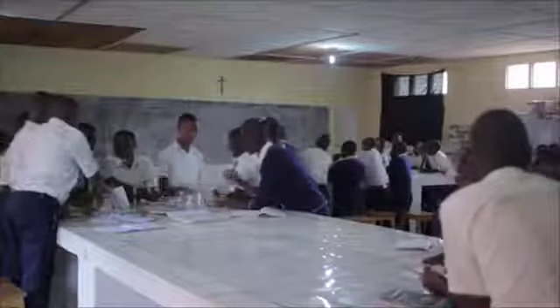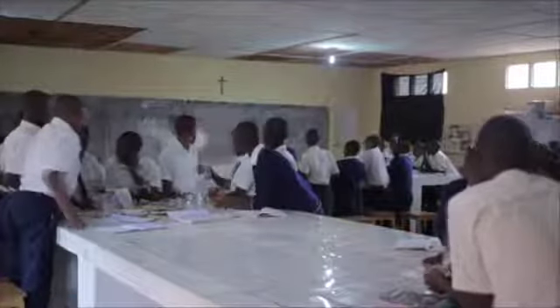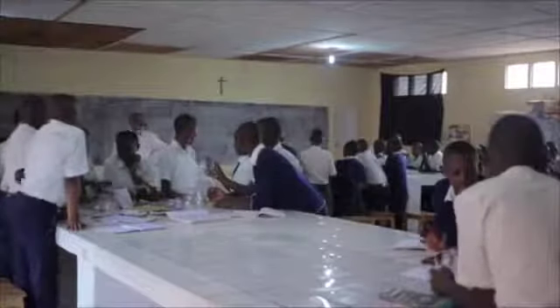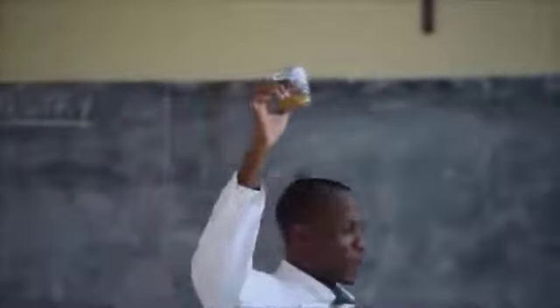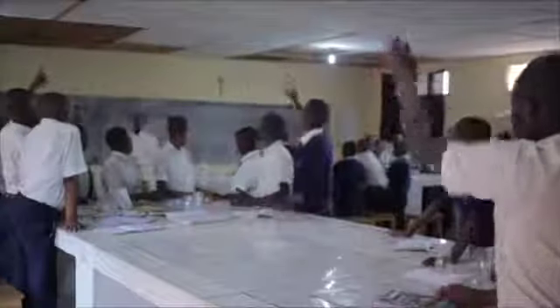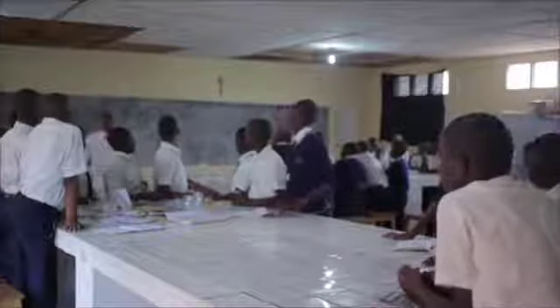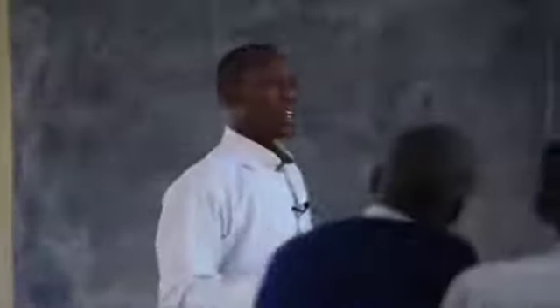In all your groups, we have one substance remaining. All of you have it? Yes. There is a substance remaining. What is this? Okay. In this, you said? Crude alcohol.